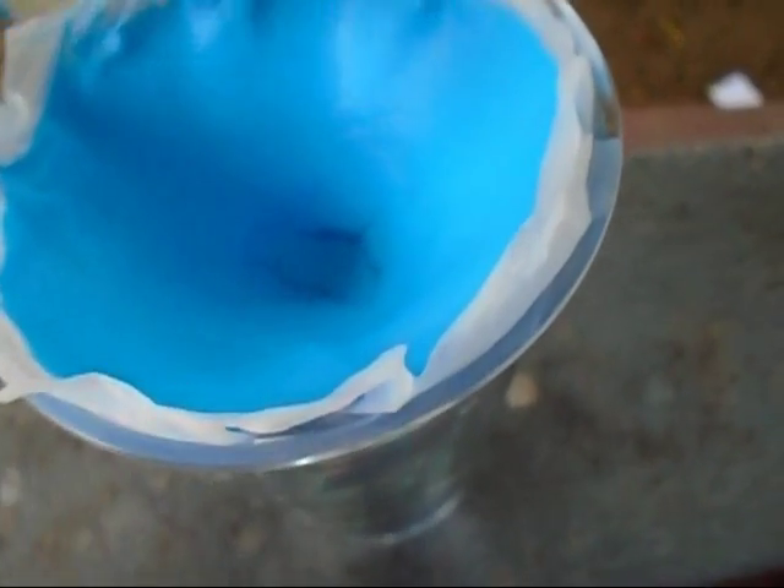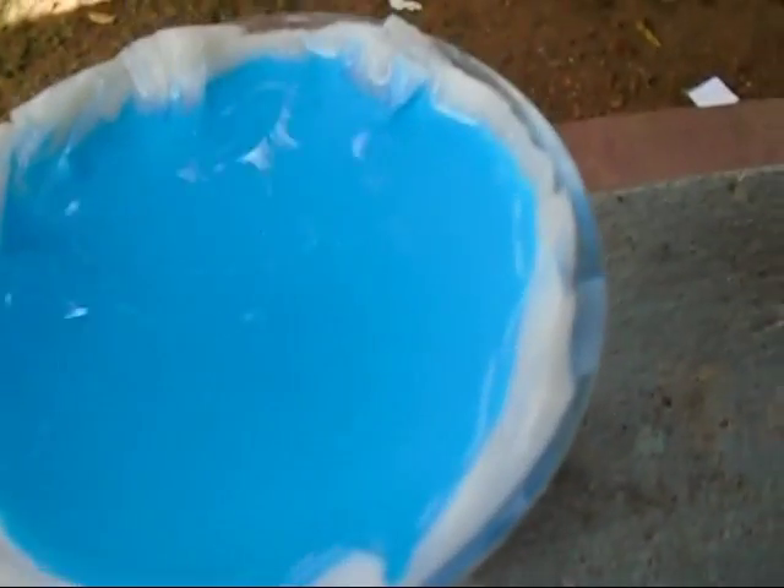Now you can see there is copper hydroxide and there is excess water solution. Today we wash the copper hydroxide.